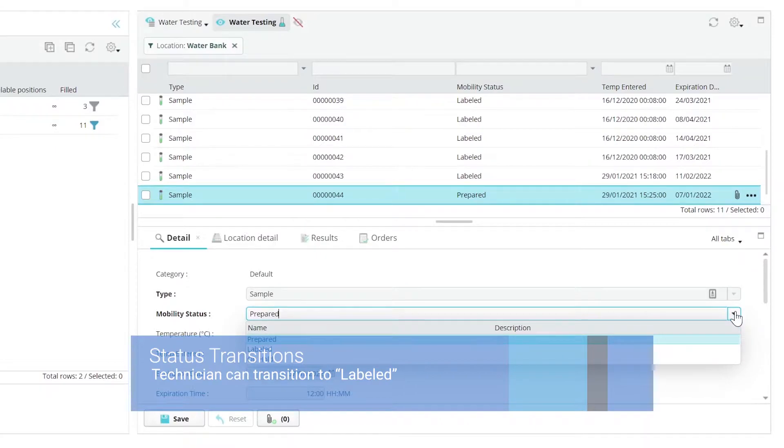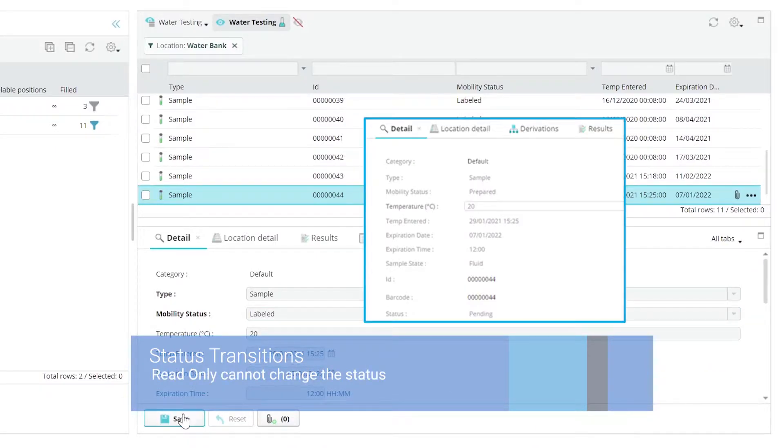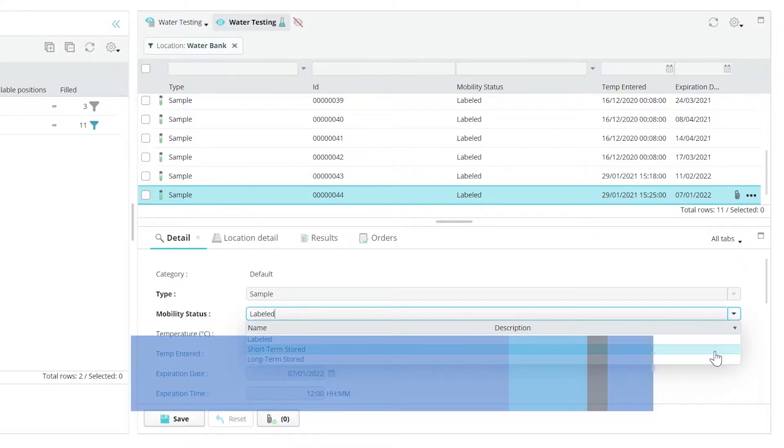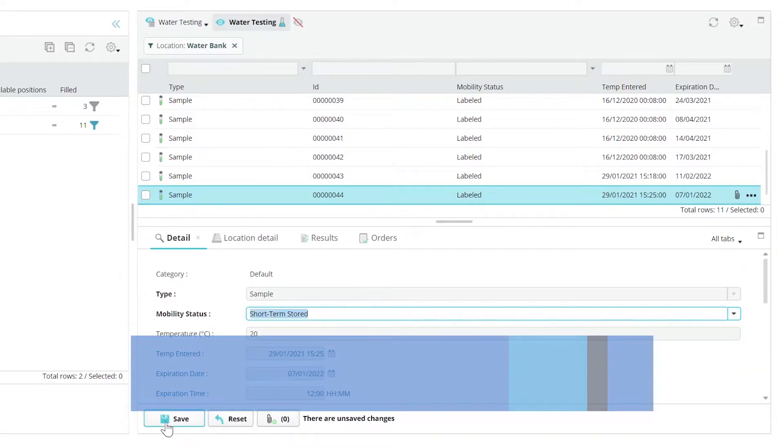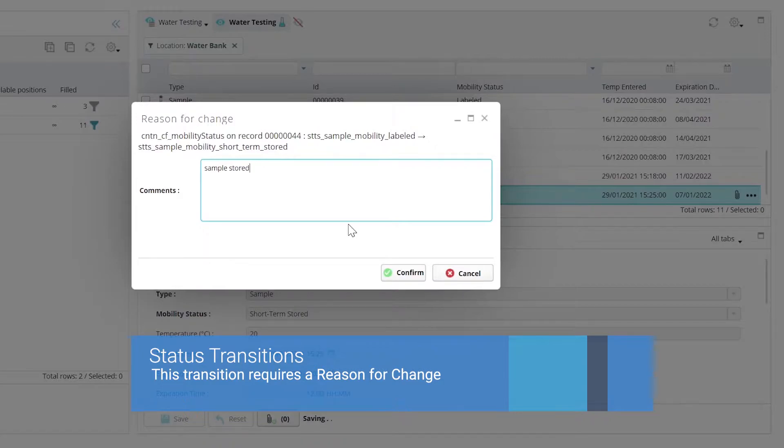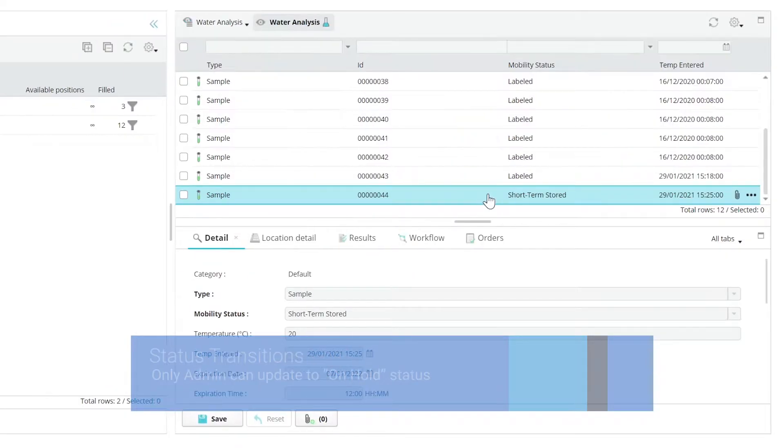There are many options on status transitions that affect the mobility of records between various statuses. They affect which users, roles, or groups can execute a status transition, which transitions are available in a status workflow, and which status transitions require electronic signatures and or reasons for change to execute.